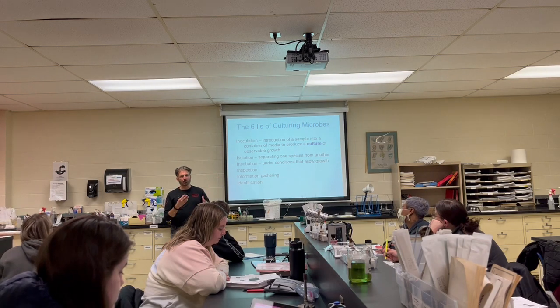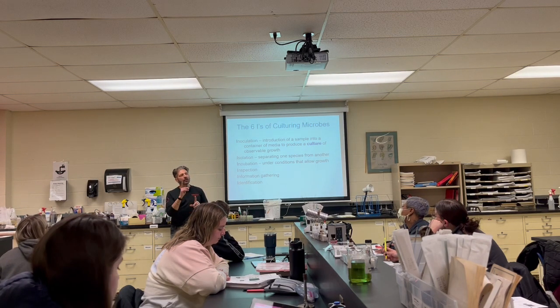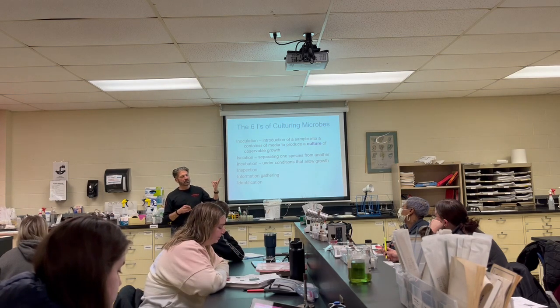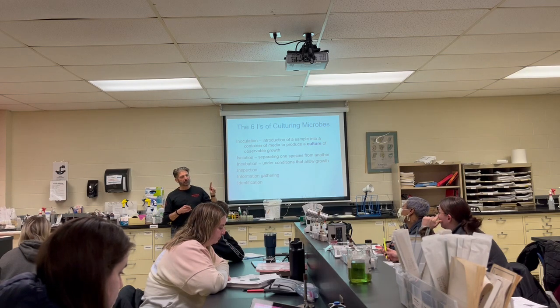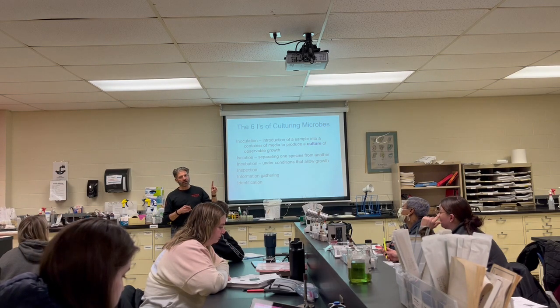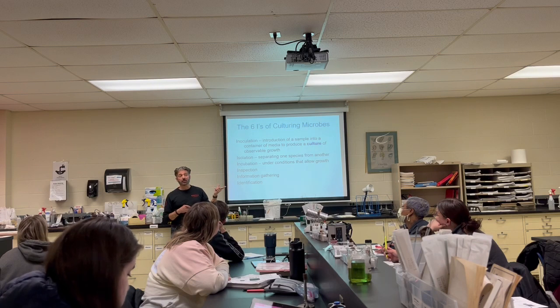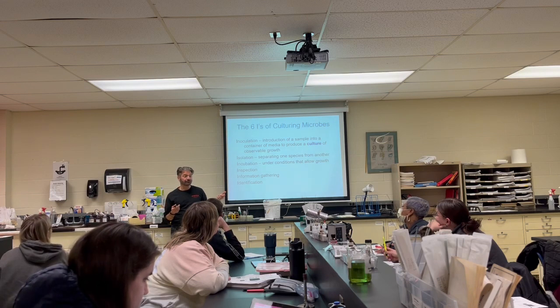Yes, it's going to get a little bit murky. If it changes color, or it gets a little bit denser, I realize something's growing in it. But can I tell if everything in that container is alive? No. I know something's growing, but I don't know if it's all alive because with bacteria, you can't take their respiration or pulse, right? I don't know if they're alive or dead.